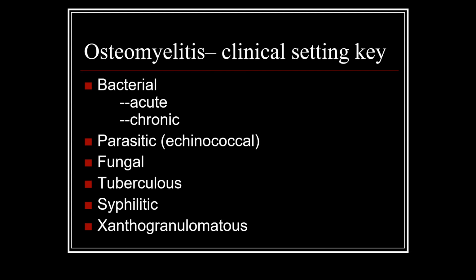Xanthogranulomatous osteomyelitis is kind of just a descriptive term where we don't have an identifiable microorganism. Have this very characteristic process that develops. So we'll go on here to the next slide here.